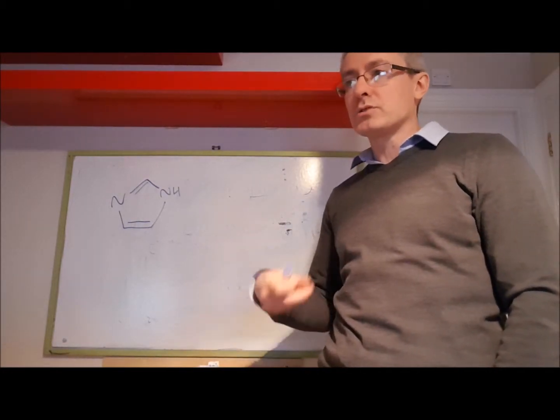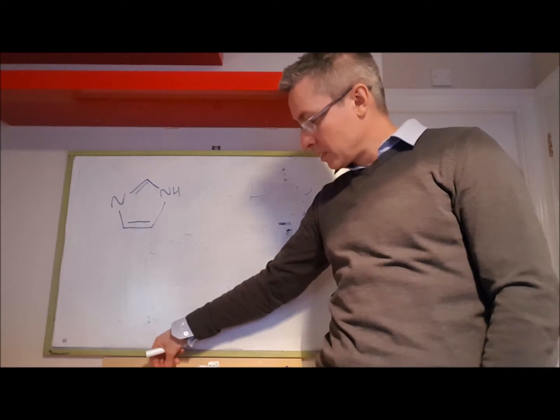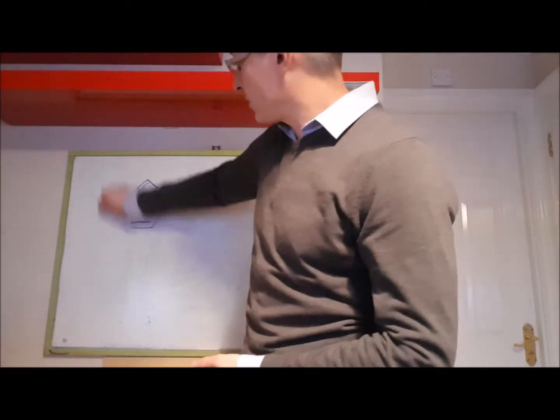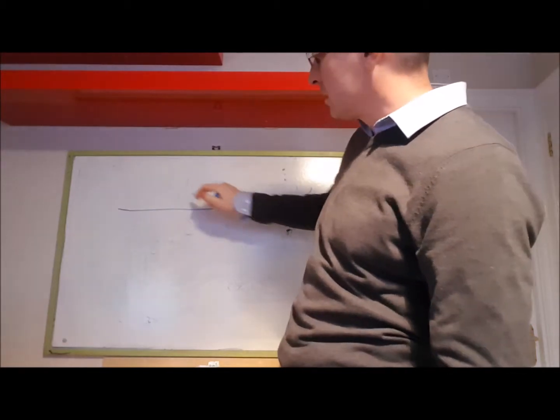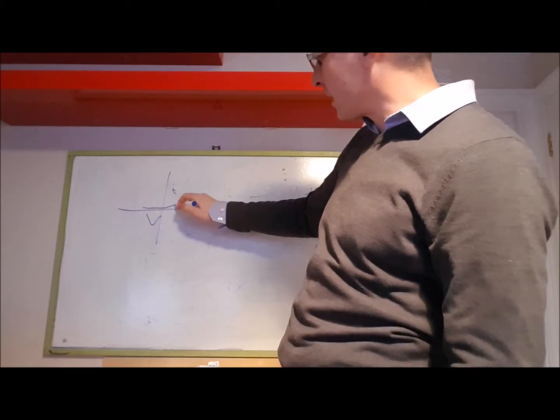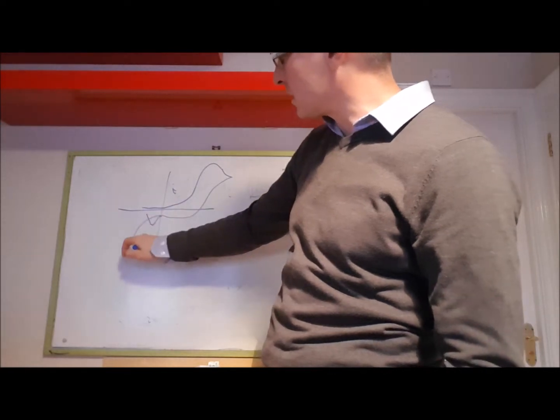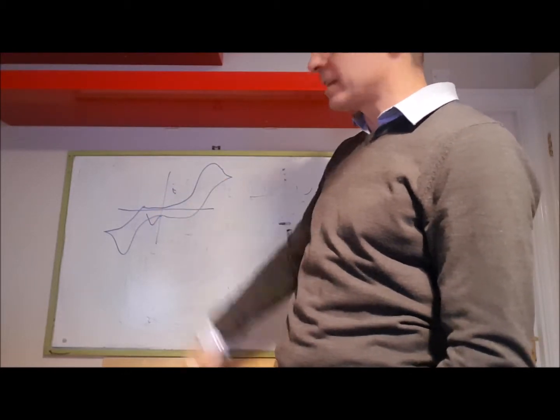So if somebody gave me an engine oil and said characterize it electrochemically, I would be tempted in the first instance to take one of these electrodes and actually put a sample on it and do a cyclic voltammogram and see what I got. Now I'm just going to sketch some ideas of what I would potentially get. So I have voltage and I have current here, and I would scan it, and if I was lucky, I might get some oxidation peaks. Maybe I don't get the re-reduction, maybe I get something down here, so it's quite ugly in some ways, but I have some electrochemical activity in that engine oil.